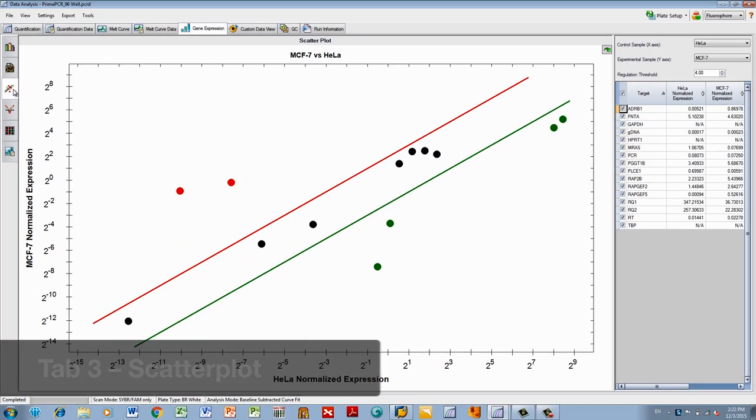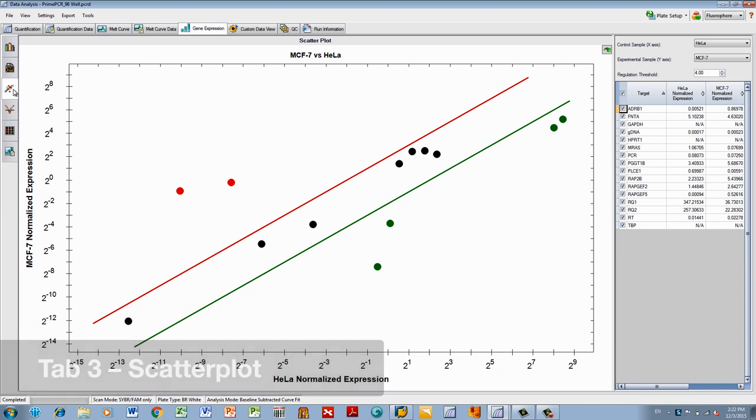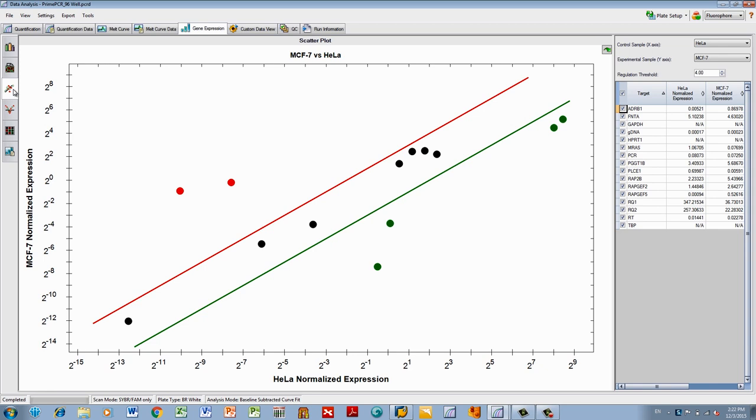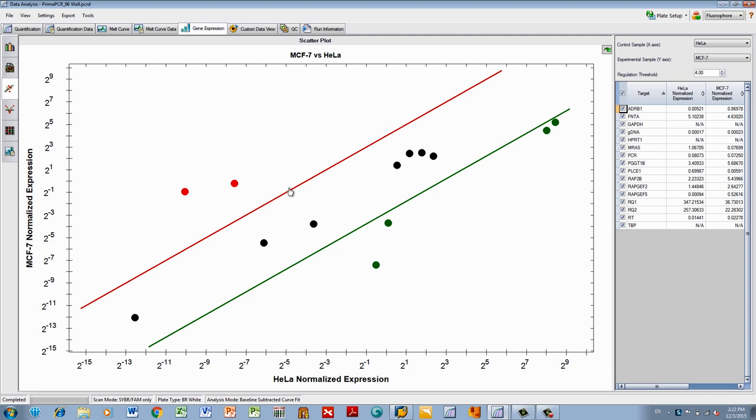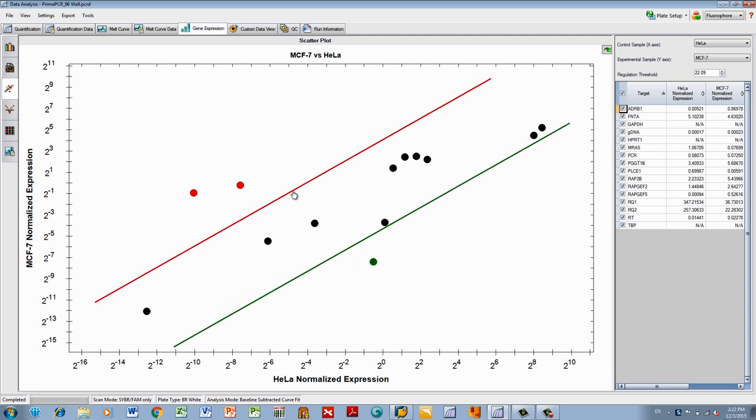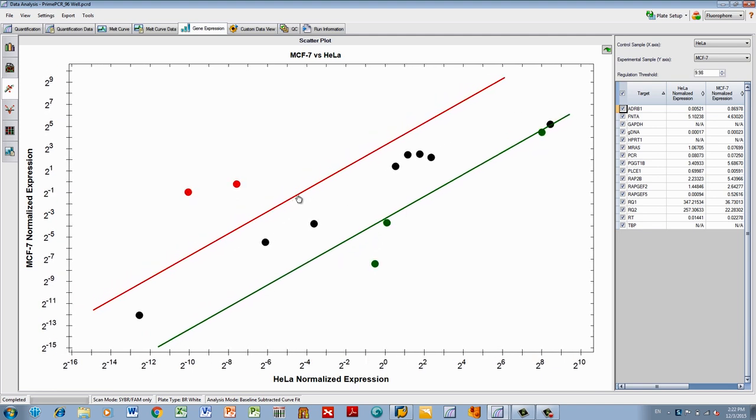The third tab, the Scatter Plot, shows the relative normalized expression. The lines indicate the regulation threshold and can be changed by dragging. Regulation is a measure of the increase or decrease of the relative normalized expression.